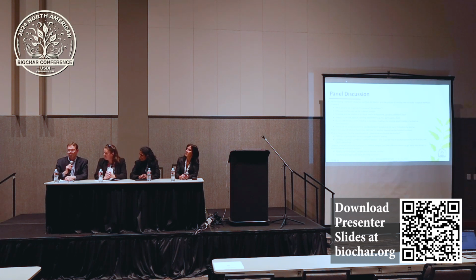So we follow ISO 18134-1. It's a reference method, not a simplified method. It's 105 degrees, and it specifies to put it into the oven for as long as necessary in order to get out all the moisture, and that's gravimetric. So generally, if we receive a sample today, we put it in today, we'll pull it out tomorrow morning. We keep them in there overnight. The next morning they are weighed back and then put back into the oven, wait an additional hour, weigh them back a second time, and then verify that there's no additional weight loss or within a tolerance of weight loss.